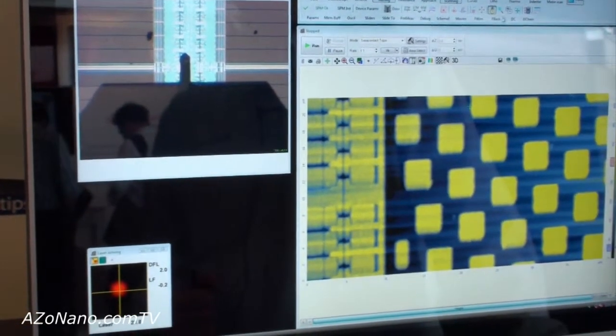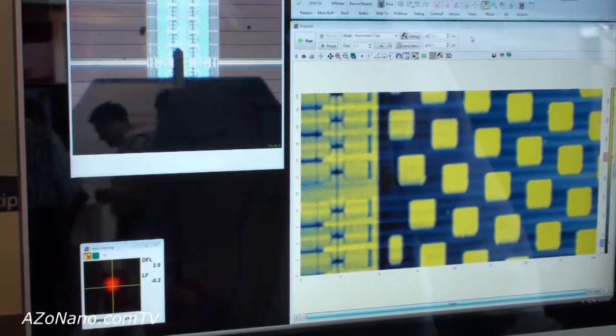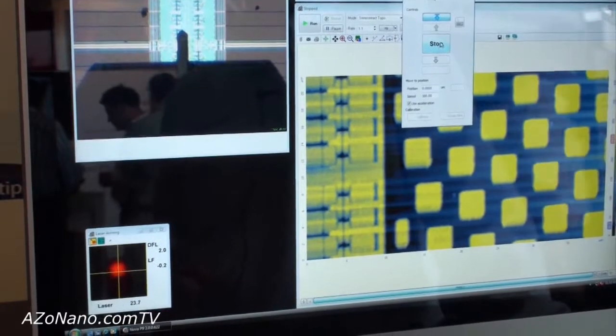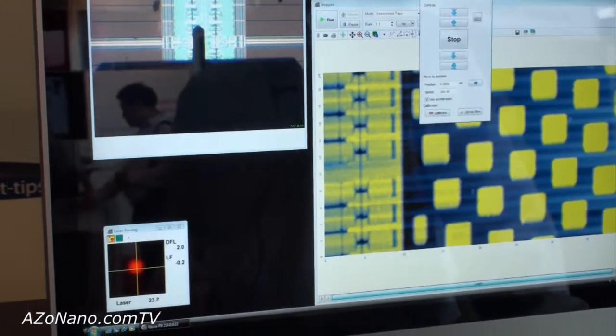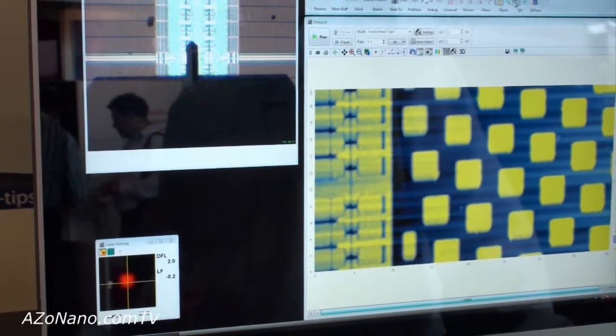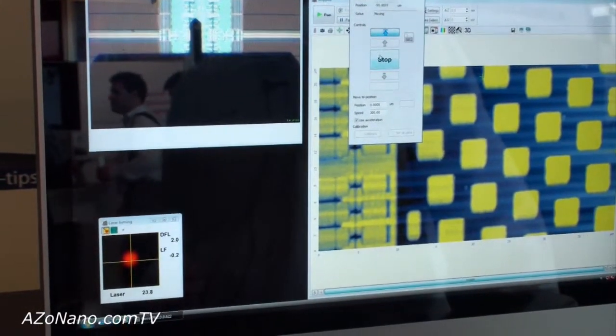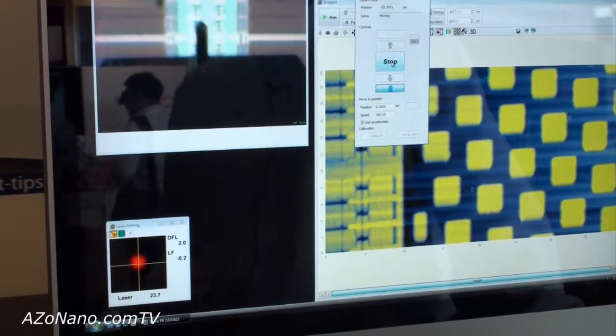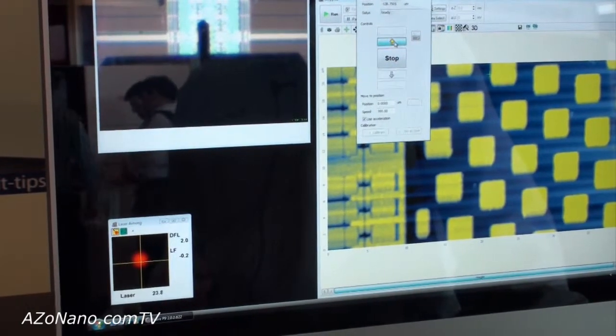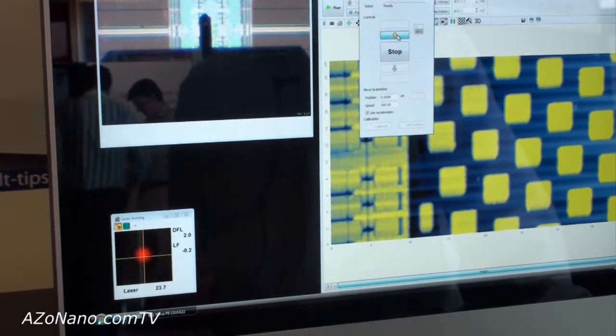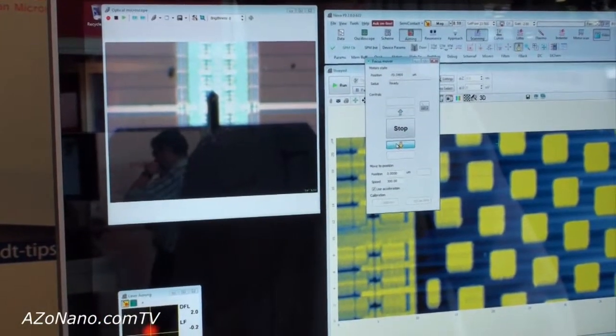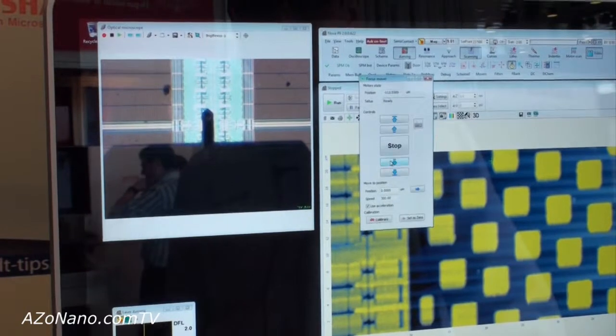To optimize the optical image, you have motorized zoom - zoom in and zoom out - and motorized focusing. We can adjust the focus like this.